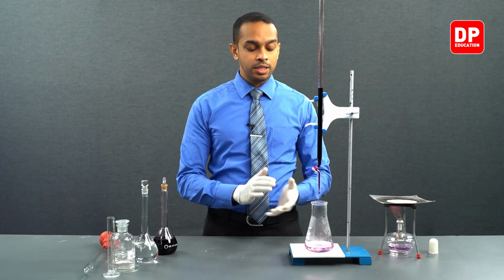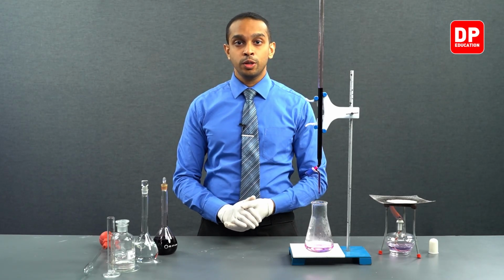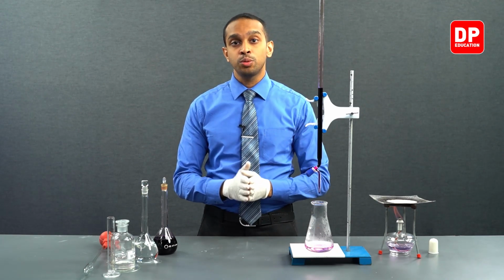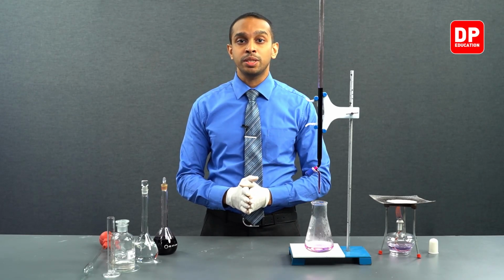Just like this titration, we have to do 2 more titrations so that we have enough measurements to move on to a calculation, knowing that we did not make a lot of mistakes.